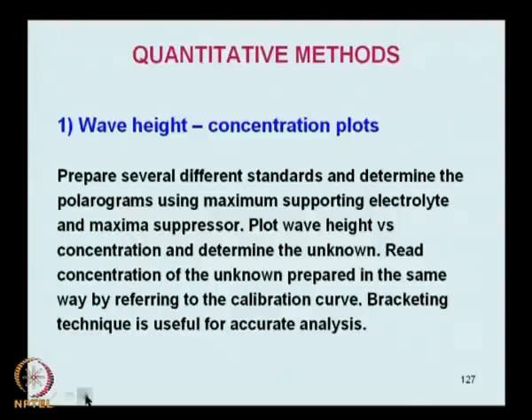Now, how do we really do the quantitative analysis? As expected, what you would like to do is to determine the decomposition potential and the wave height. If the concentration is more, wave height should be more, and if the concentration is less, wave height should be less. So, you can take the standard solutions, determine the wave heights for different concentrations, and plot the calibration curve of the wave heights versus the concentration. Then you can take your unknown sample, determine its wave height and refer it to the calibration curve.